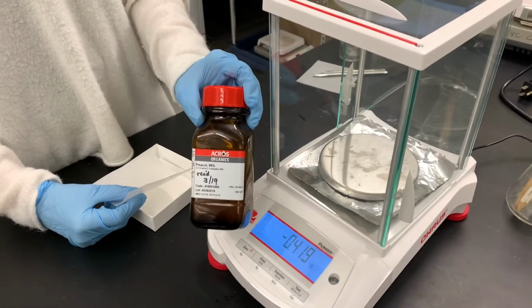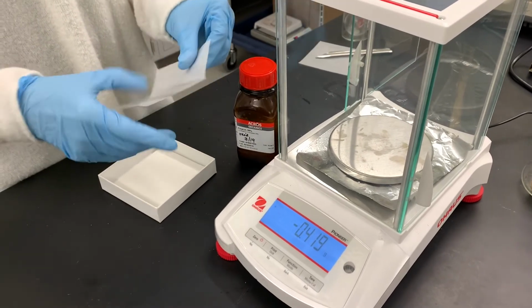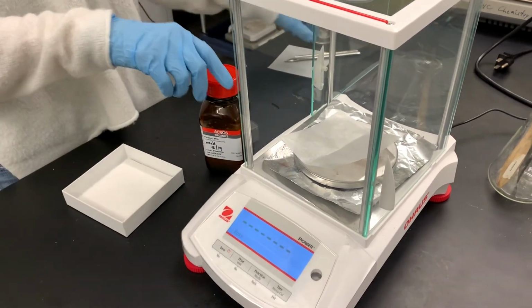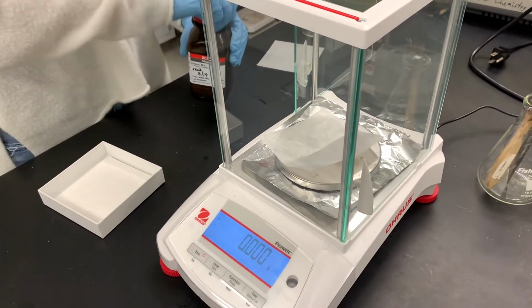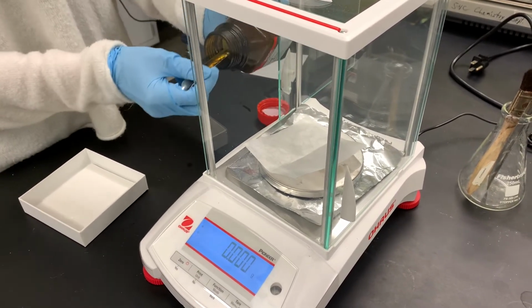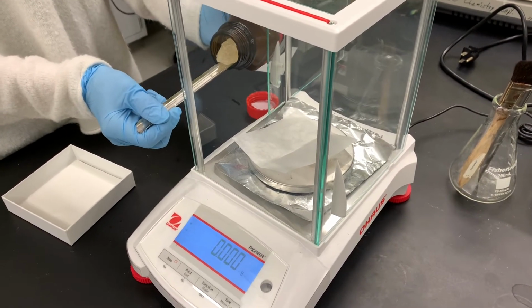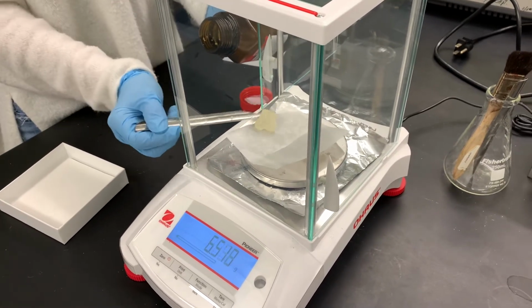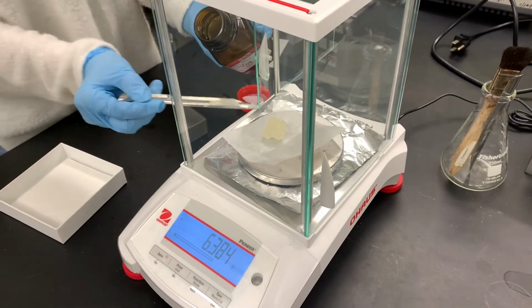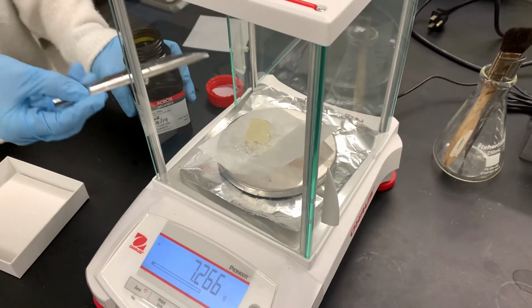We're going to be starting with 7.1 grams of pinacol. It is kind of a sticky, clumpy solid, which is probably going to make it pretty difficult to get 7.1 grams. There are some really large chunks inside this bottle. There's a huge chunk. These are really big pieces. We'll go with that, 7.266.